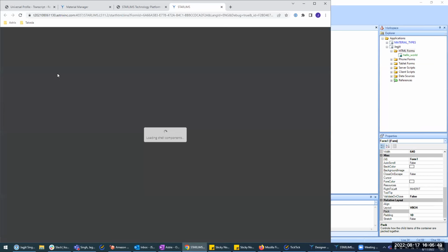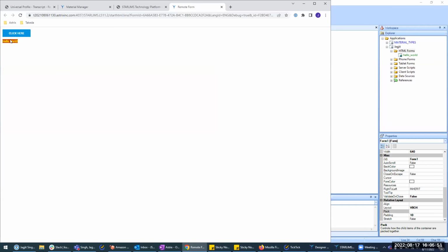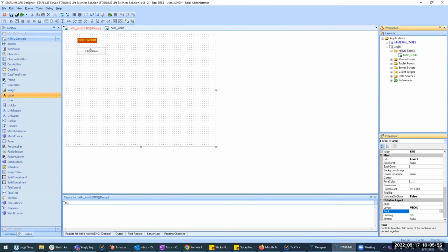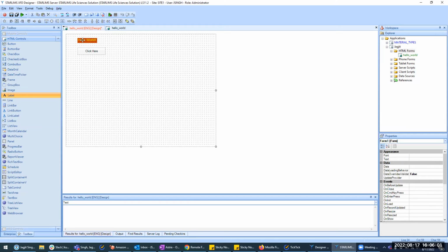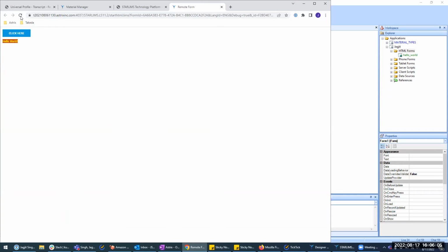I think your click here might be above your hello world. Yeah. Okay, so let's push it to back. So hello world. No, the other way. Oh, the hello world. Okay. Yeah, that one, push send to back, which moves it up. Reverse your thinking. Beautiful. All right, click on it. You're not clicking. No, okay.